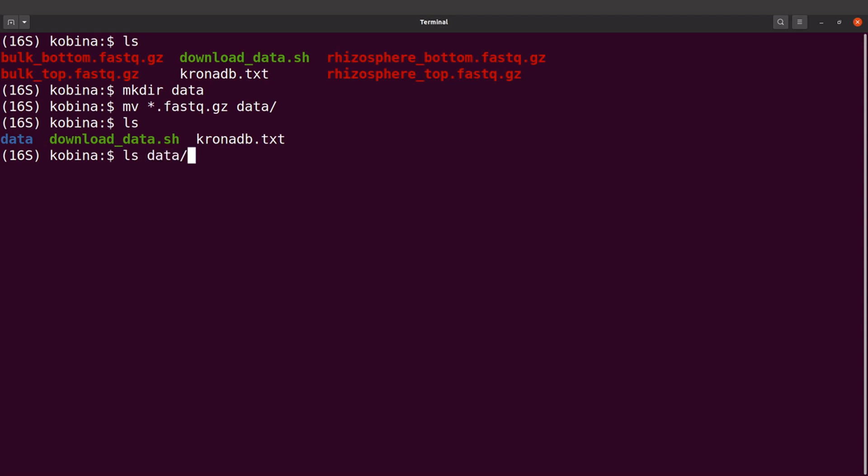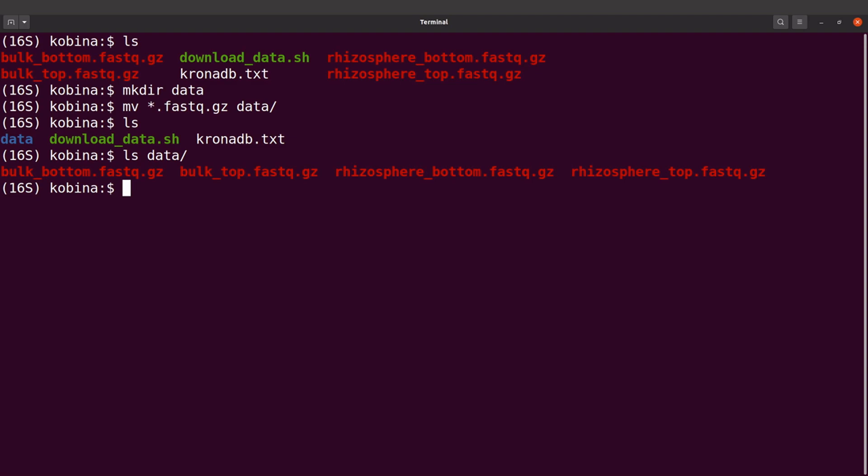Let's do an ls into it and we're going to find a file there. Now we have that done, so what we're going to do next is perform quality control. We're going to run FastQC to perform some analysis, then we're going to use MultiQC to aggregate the results, and then we can view them using our browser.